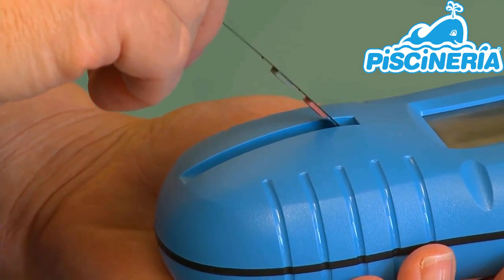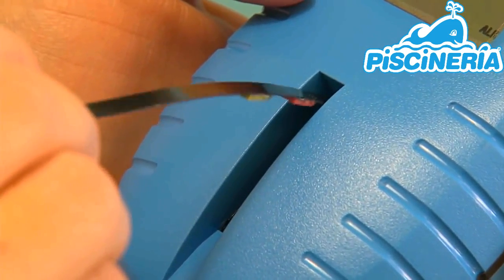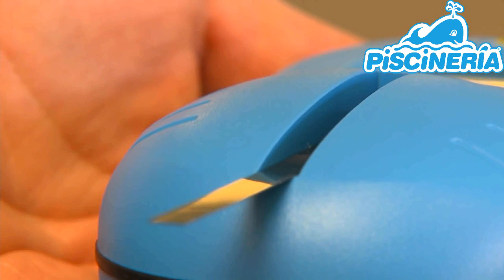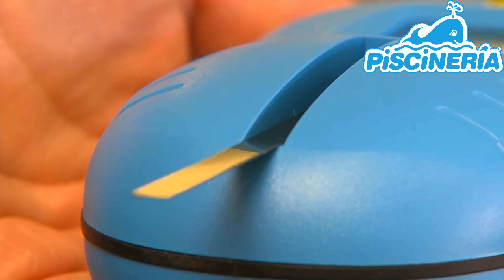Now you are ready to place the test strip into the test strip window. Put the test strip into the back of the channel at a 45 degree angle and lay it flat. It is very important not to slide the test strip across the reader window. This will cause the chemistries to mix and give you inaccurate results.